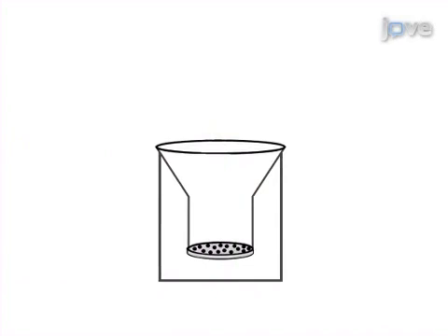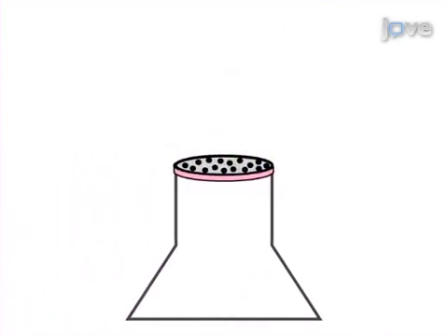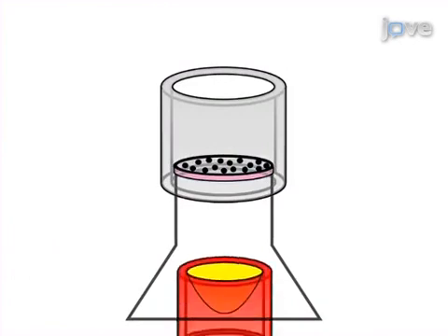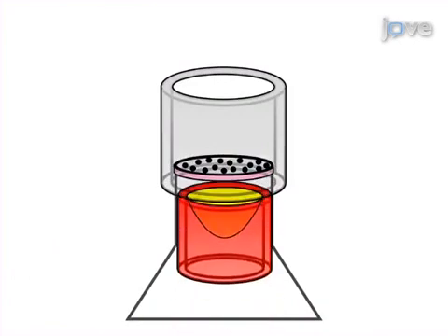Coat the luminal surface of the porous membrane with an extracellular matrix protein, like collagen. Fit the inverted insert with an external silicone tubing and an internal silicone plug to create a removable well above the abluminol surface of the membrane.